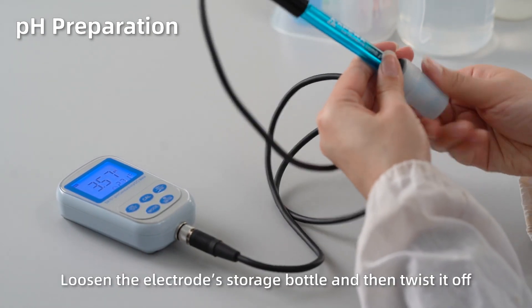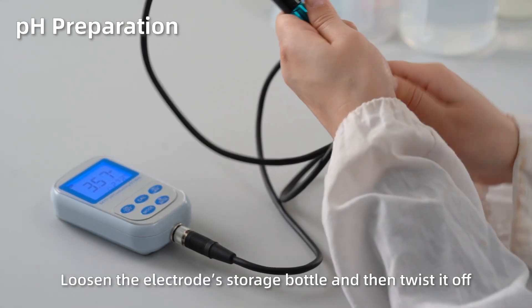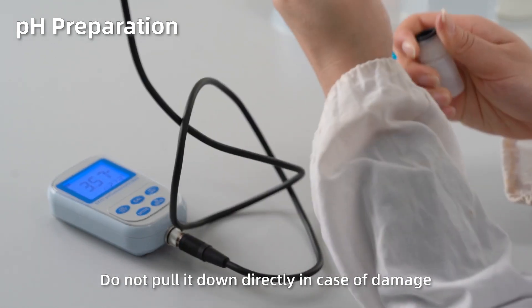Loosen the electrode storage bottle and then twist it off. Do not pull it down directly in case of damage.